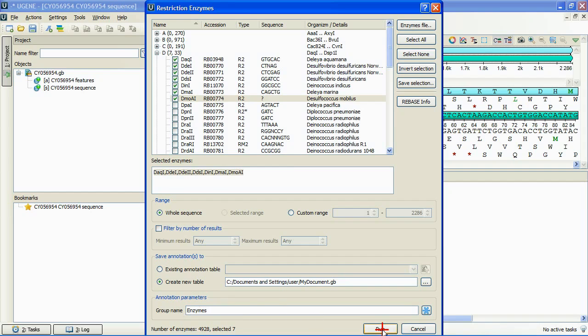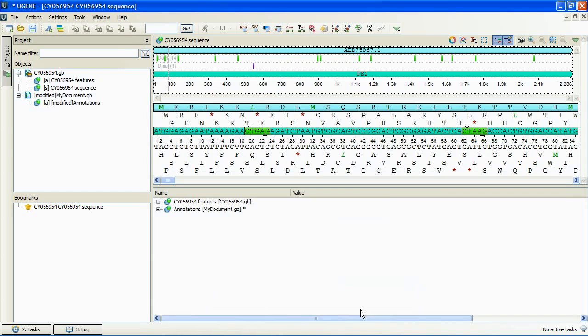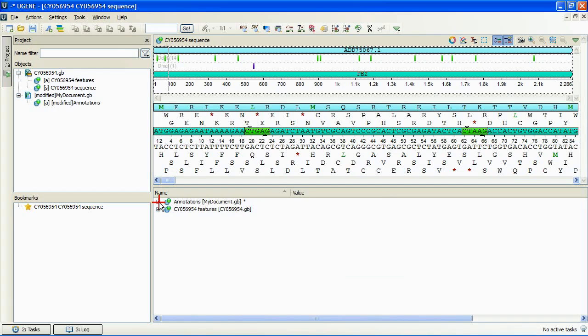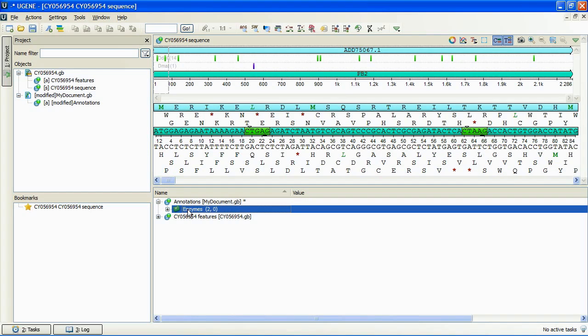The new document containing all the results annotations is added to the Annotations Editor. And we can see the results annotations sorted by enzymes at the Panoramic view.